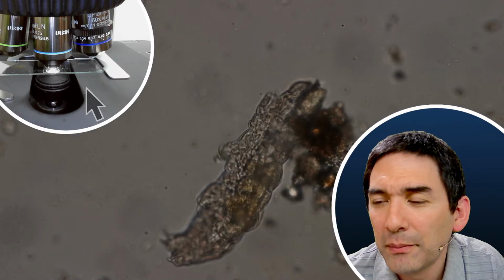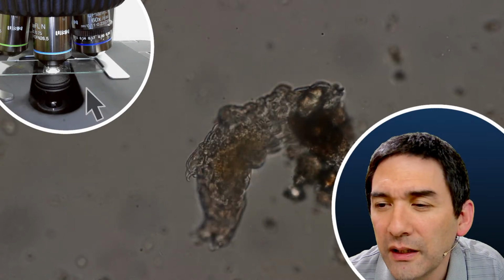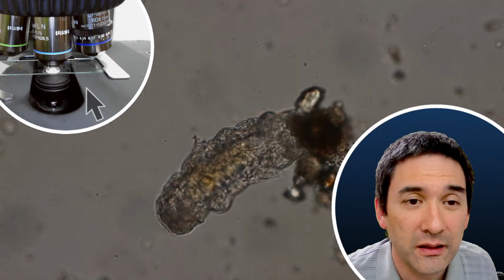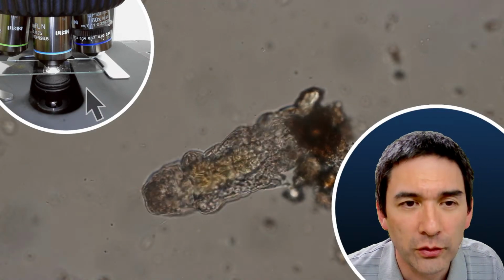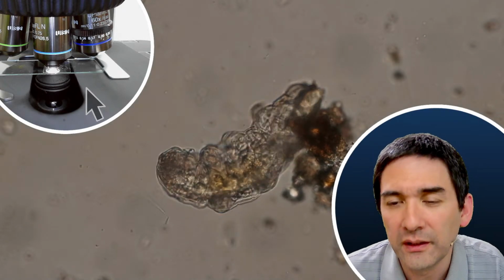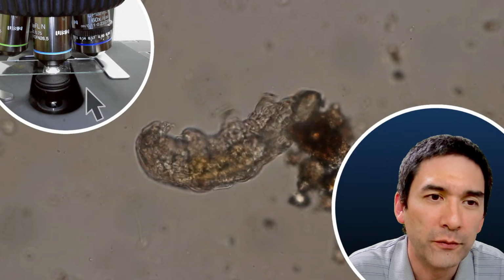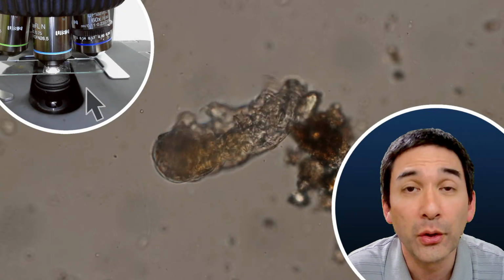Depends. For some samples it looks very nice, but for others, yes, exactly. I do not want to have any residue or dust in the light path being captured through the camera. Yeah, I get it, but unfortunately, dust is a general problem. What you can do, and this depends a little bit on whether it's really worth it, is that some microscope companies actually do offer cleaning services. Basically, they will take it apart and do the cleaning for you.